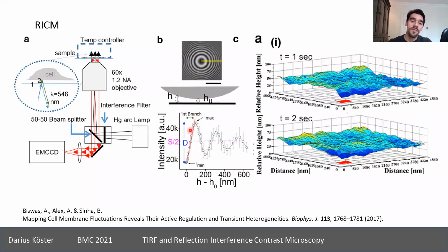When you do this carefully, you can see the calibration, how your intensity changes depending on the height. And so you have two pieces of information. One is the intensity, whether it's positive or negative, maximum or minimum. But then you also have the total intensity, which tells you whether you're in the first maximum, which is the closest height.